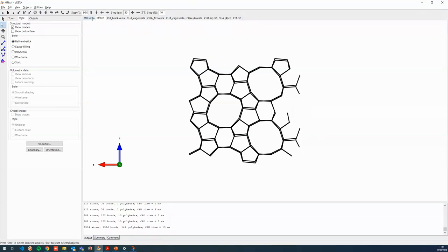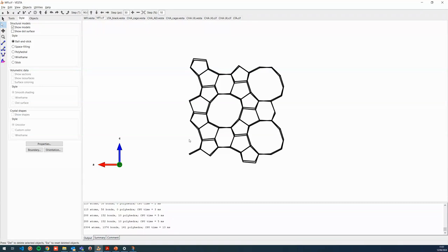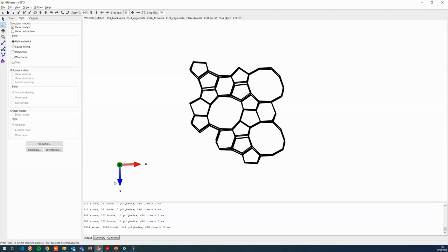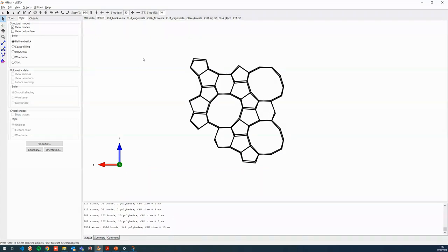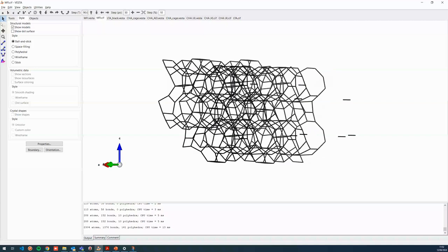We can remove what we don't want. Let's see what we removed, like so. So I'm just selecting and pressing delete every second to remove the unwanted parts. See, it's over here. I also removed some parts. There you go. We have a very similar figure. Now, you can see from the axis that it's a different orientation. In a 2D picture, obviously, this will not show, but it's not exactly the same. But for a 2D picture, it's fine.